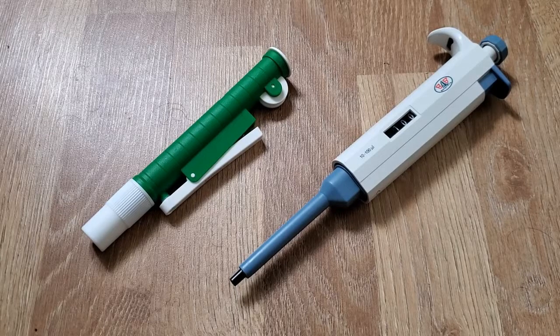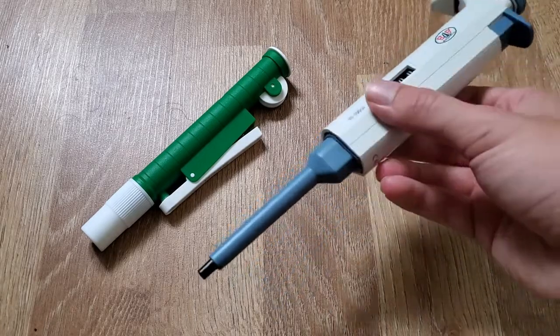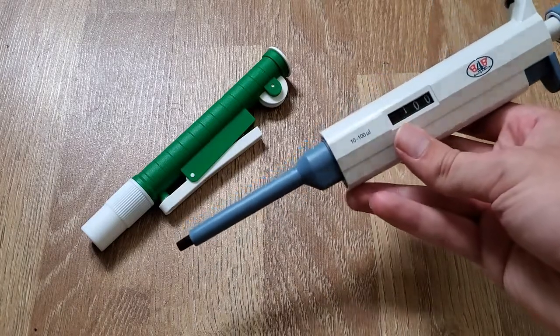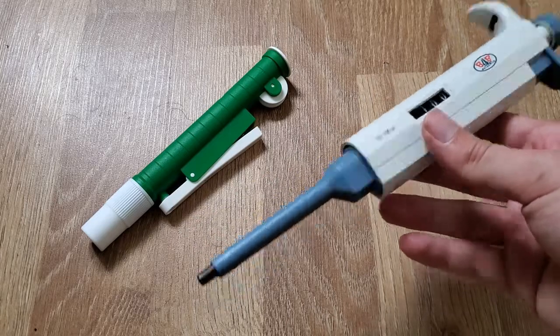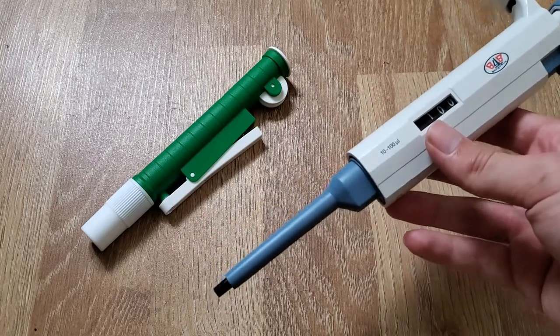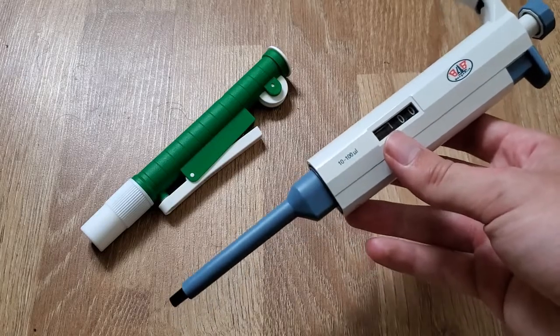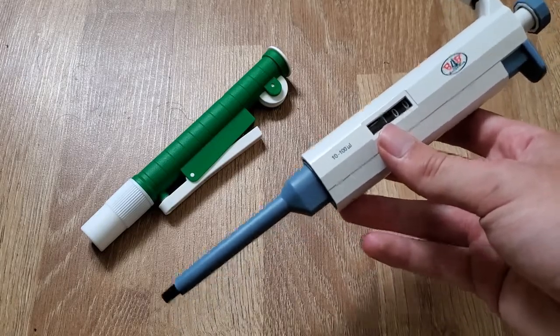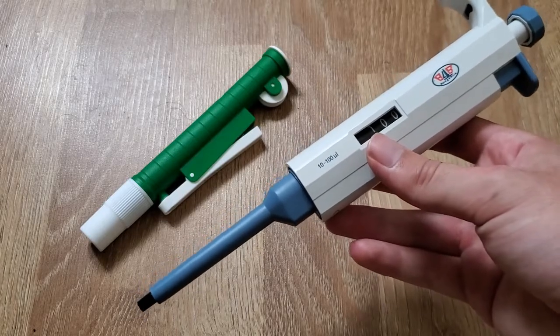One project that I wanted to do for a while now is to make my own 3D printed pipette. In the lab there are really two kinds of pipettes. There's the micro pipette, for volumes from one microliter to about one mil. They come in slightly different ranges, so you typically have three of these: one goes from one to ten microliters, the second from 10 to 100 microliters, and the third from 100 to 1000 microliters.